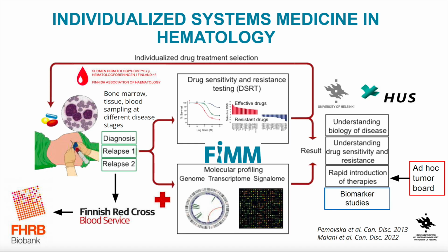Some of these assays included standard next generation profiling analysis, including whole exome sequencing and bulk RNA sequencing, but also high throughput drug sensitivity testing.